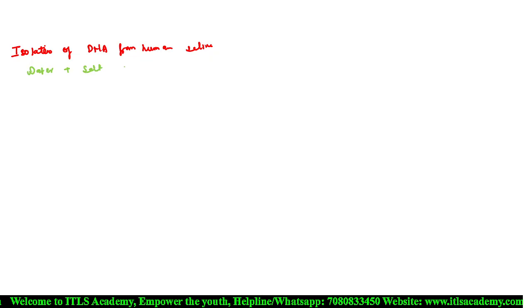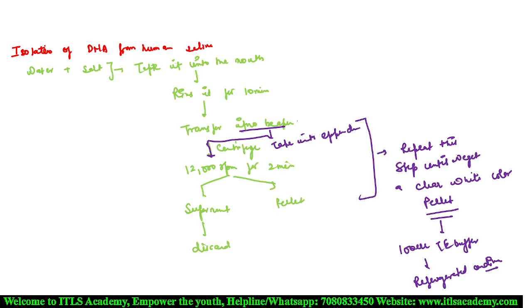Okay, when we get the clear white color pellet, then we add 100 microliters of TE buffer for storage and store it in refrigerated condition. Is my point clear? Yes, ma'am. And I will show you the video related to this. This is very easy.